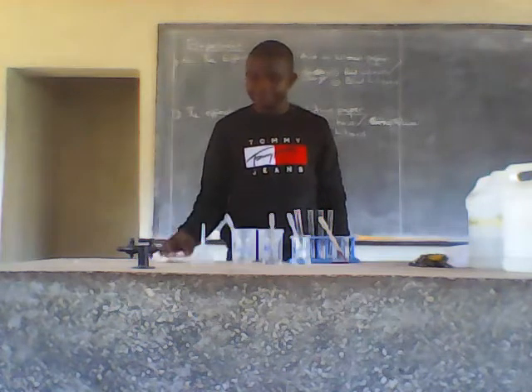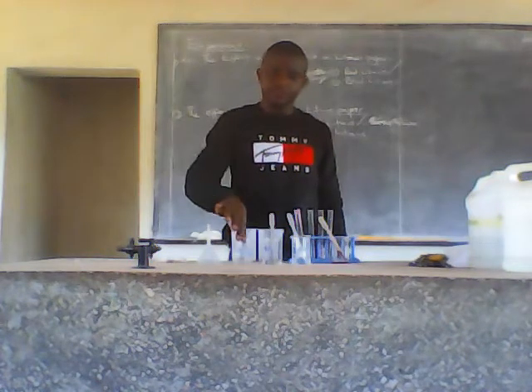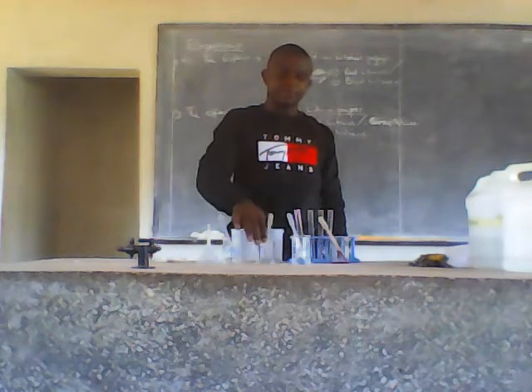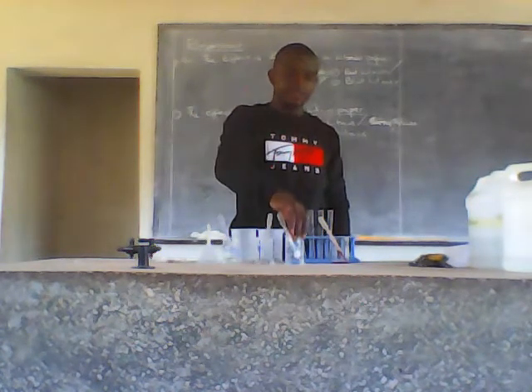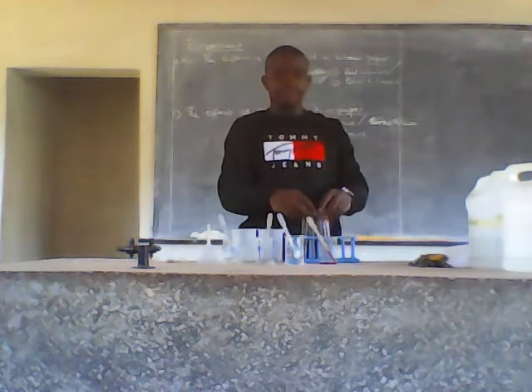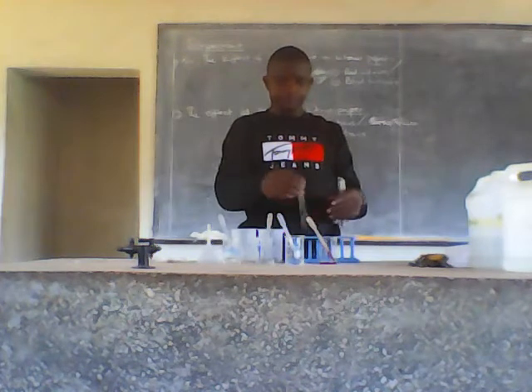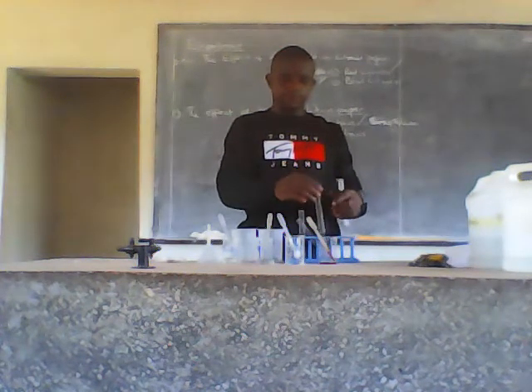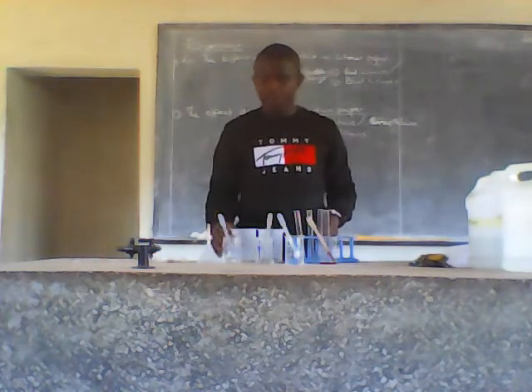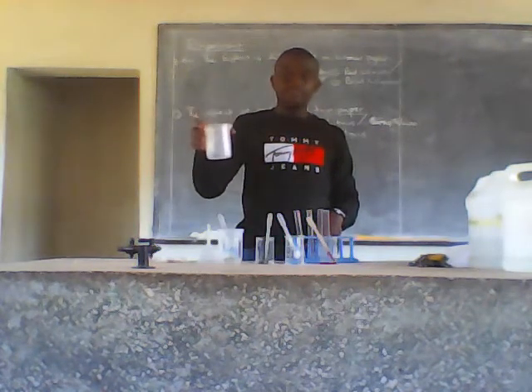I have a filter paper, a funnel that I'm going to use during the process of filtration, barium nitrate in a beaker, ammonia in a beaker, sodium hydroxide in a beaker. I also have four test tubes, a test tube rack, an empty beaker, and a beaker containing 50 mL of water.